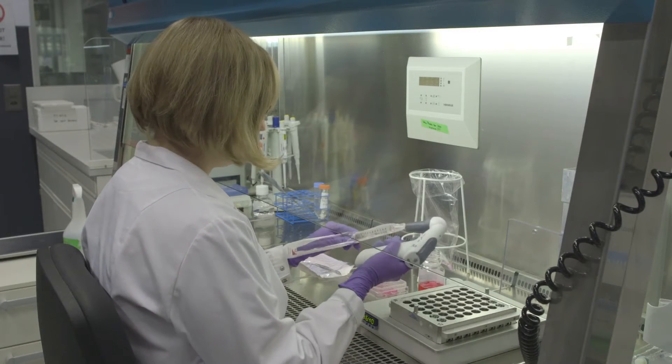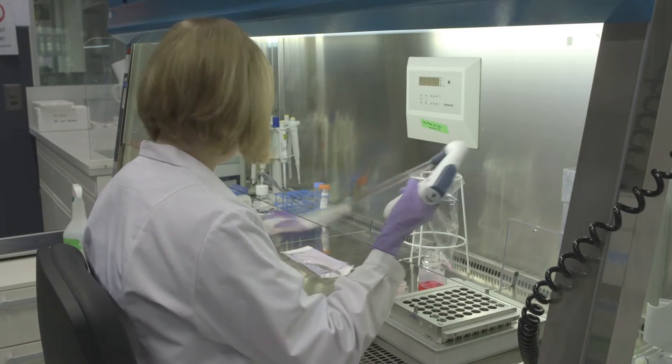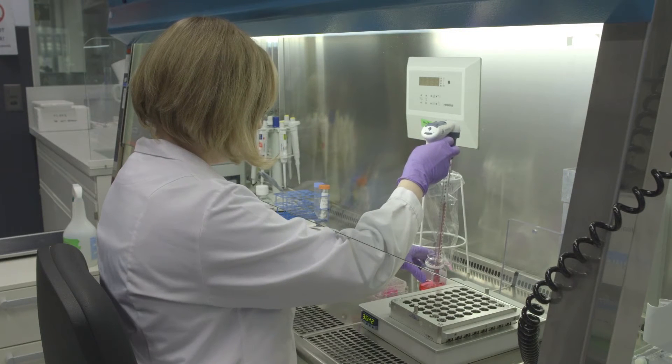In this video, you'll see how we expose cells to fresh air, cigarette smoke, or aerosols from our reduced risk products.